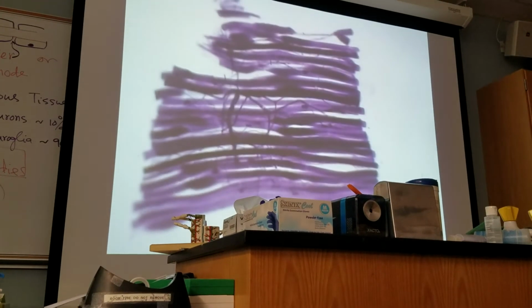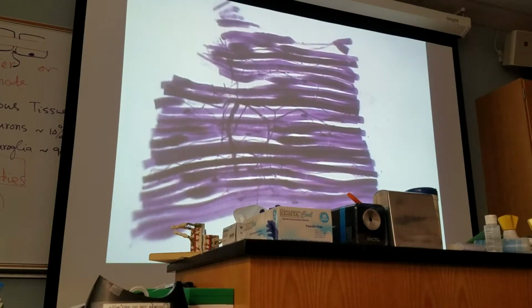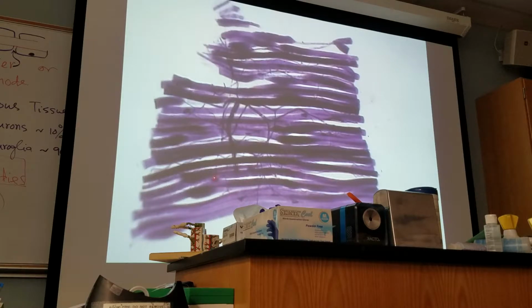Beautiful. Look at these synaptic end bulbs. These are muscle cells, and these are parts of a motor neuron. Each area is called a neuromuscular junction, where the synaptic end bulb from the presynaptic neuron, the motor neuron, makes a synapse with a muscle cell.